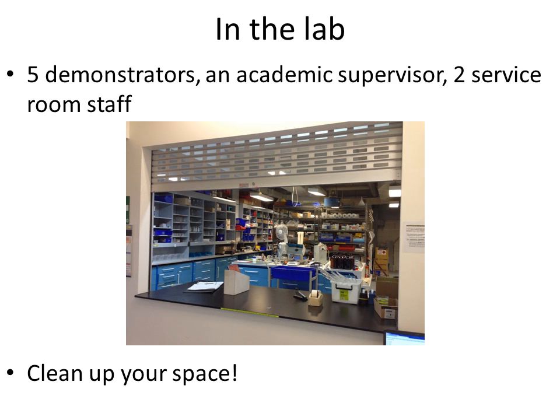You must clean up your lab space before you leave, and leave it looking the same as when you came in. Students the next day will be using the same equipment and glassware as you, so you need to make sure that your things are as neat and tidy for the next lot of students. If you leave without cleaning up, you may be penalised 10% of your mark.